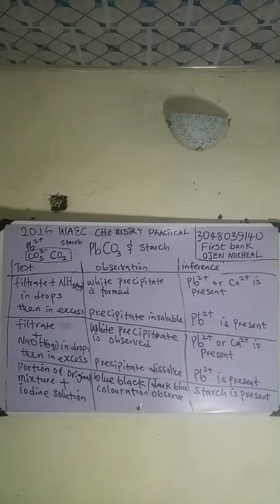We use HCl to confirm acid. HCl is acid now. How will you use acid to confirm acid?